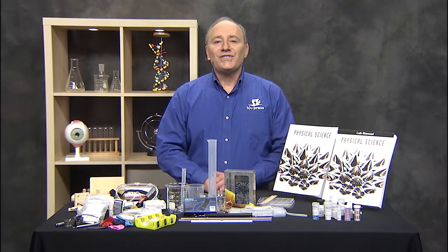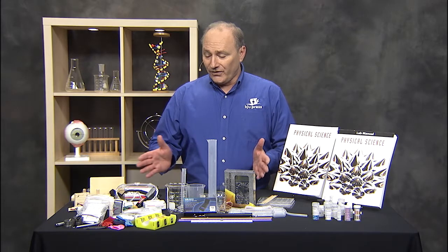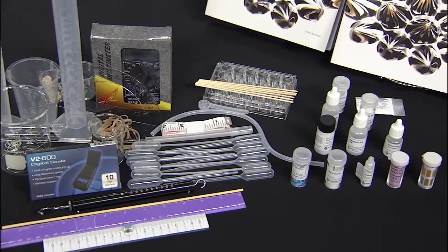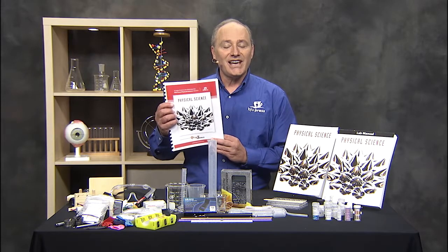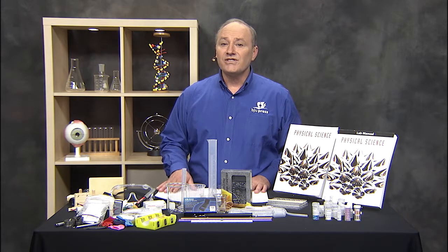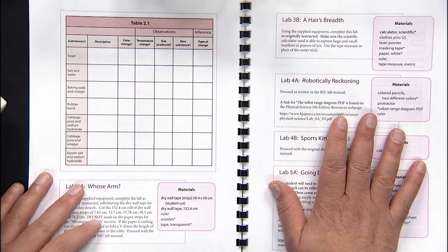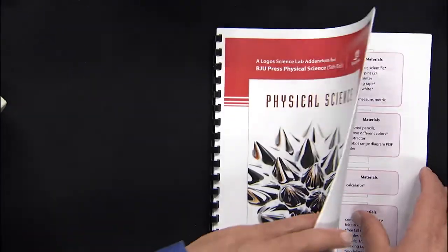The Logos Physical Science Kit has everything you need to experience these great labs. Before me is the whole Logos Physical Science Kit, and I just want to go over what all is included. First off, you get this very important addendum. It works alongside our lab manuals and textbooks. Inside are listed any ancillary items needed for each lab. The addendum modifies the labs so that they better fit the homeschool setting, and we recommend that you read through the addendum first before the lab manual.